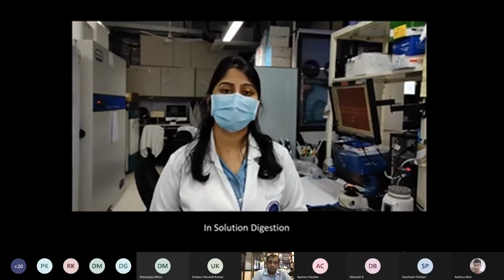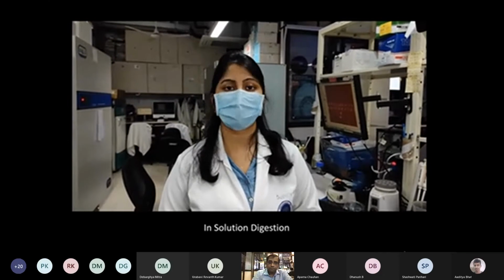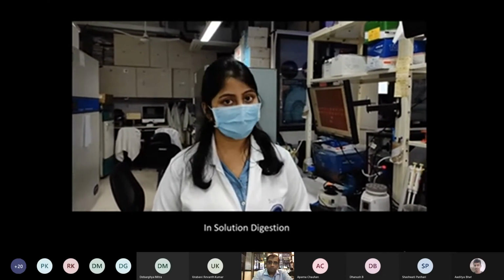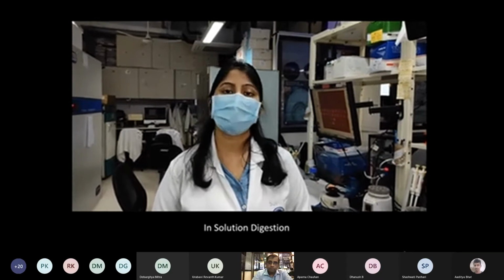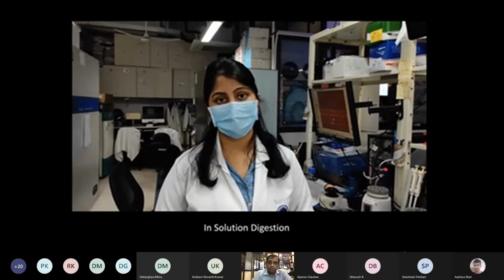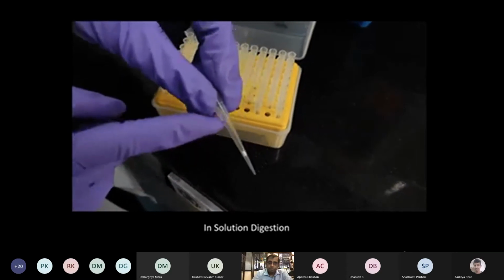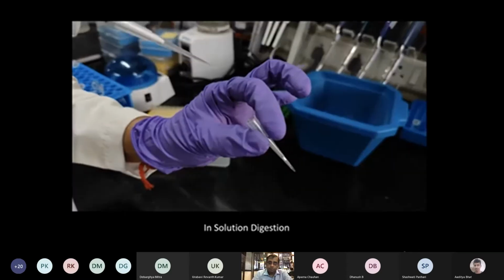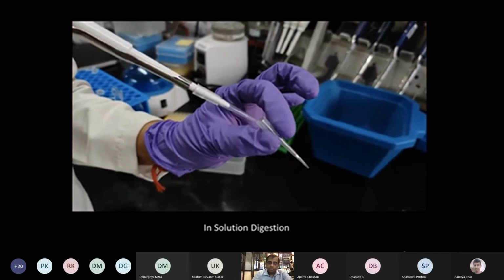For mass spectrometry, the peptide sample should be properly cleaned. To make sure that the sample is clean of various salts or other contaminants, the sample can be put through the cleanup steps. For these steps, we use C18 columns. So these columns can be made using the C18 material within the tips, and then the sample is passed several times through the column.